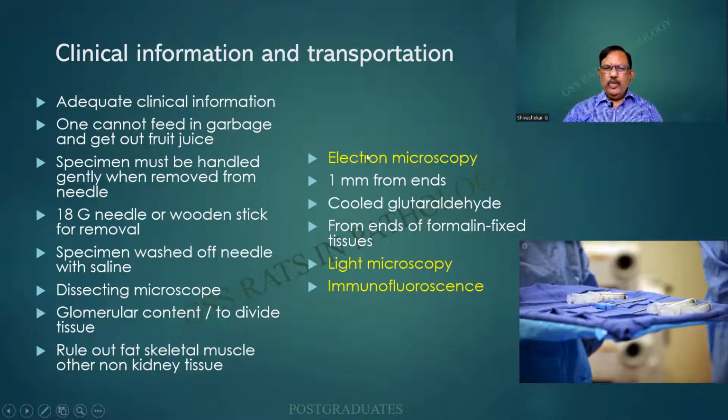And for electron microscopy, as I showed you earlier, the ends can be chosen. Glutaraldehyde can be a fixative. Sometimes even formalin fixed is being advised. Light microscopy and immunofluorescence are the other ones I have already told you.